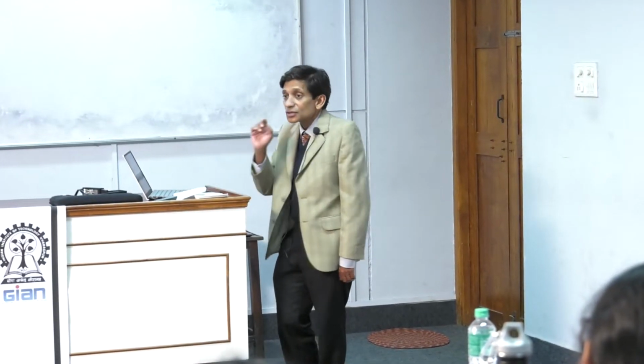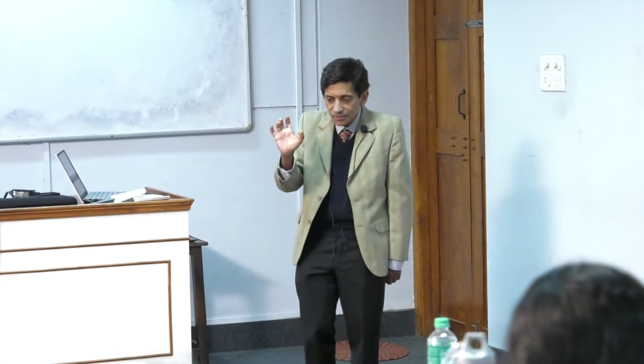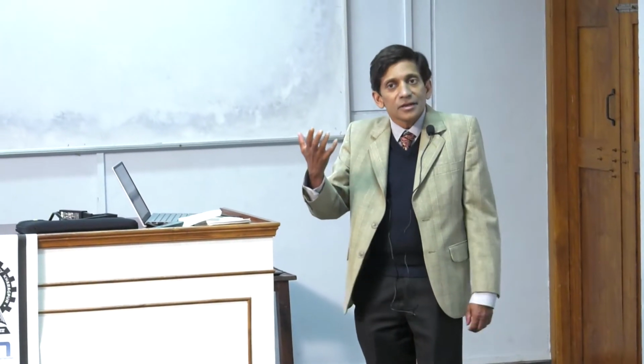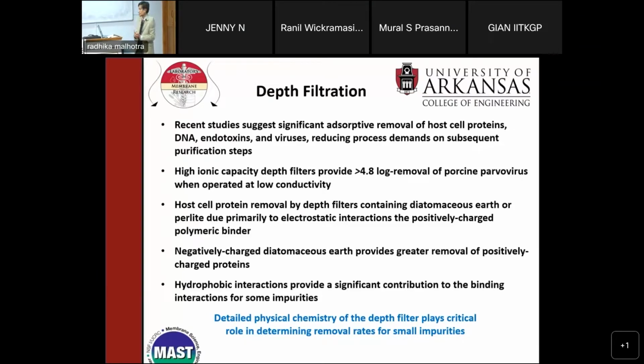Okay? So detailed physical chemistry of depth filters plays a critical role in determining removal rates for small impurities. So I'd say the take-home message is depth filtration is a very interesting process. The actual design of a depth filter is quite complicated, and from a chemistry perspective, there's a lot of work that can be done to optimize the design, not just to remove cells and cell debris, but also to remove some of these contaminants.